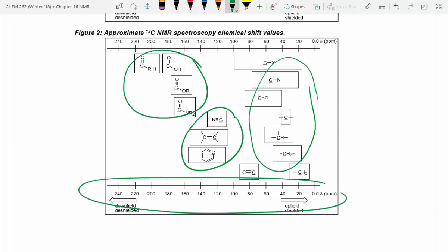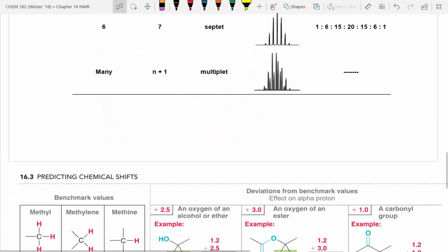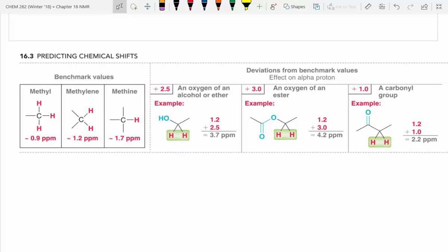Normally I try to get as much data as I can from the proton NMR and then use the carbon NMR as backup, or use it to fill in some sort of gap if I'm struggling, if that makes sense. The other thing that Klein does that's really, really useful is he gives you this guide at the end of the chapter to narrow it down even further.